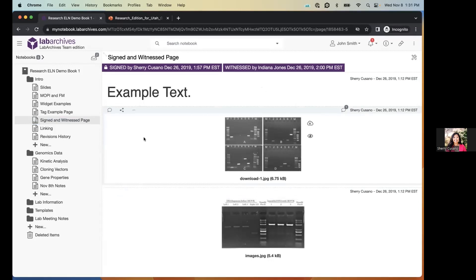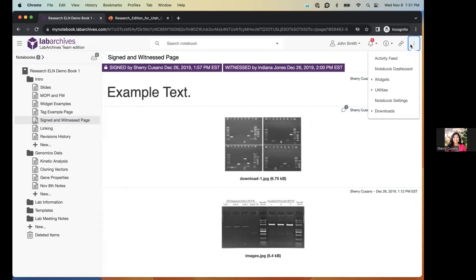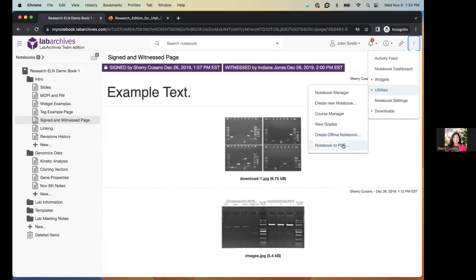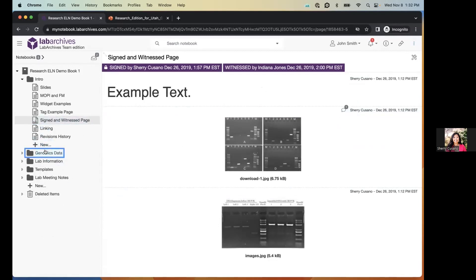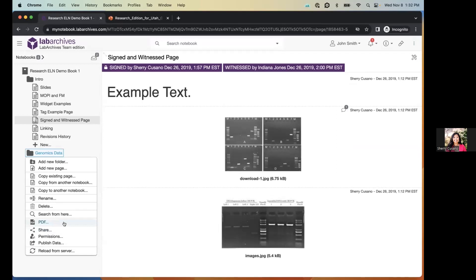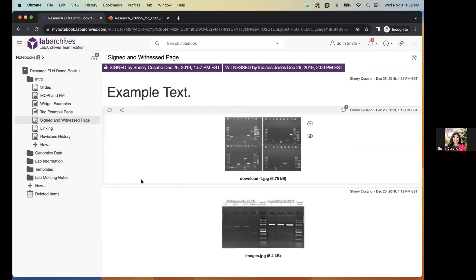To export your notebook or parts of it, you can generate a PDF or an offline notebook. Click the triple-dot menu, hover over 'Utilities,' and select 'Create Offline Notebook' or 'Notebook to PDF.' You can also right-click a folder or page and select 'PDF.' PDF versions are more reader and printer friendly, but any files in the notebook appear as links to the file online. For a high-fidelity backup accessible without internet, create an offline notebook — it generates your notebook as a zip archive of HTML files.